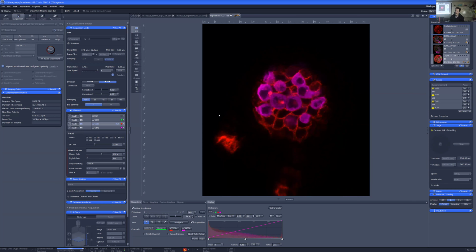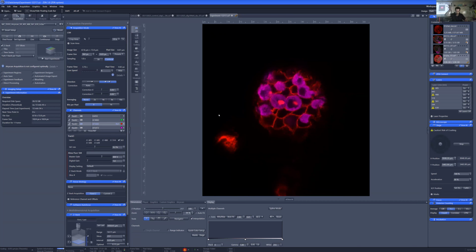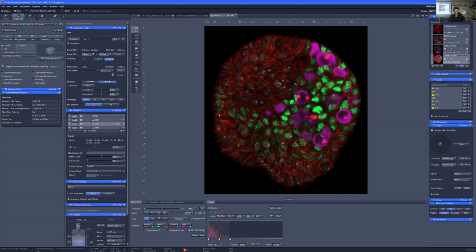I think I have a question. I'm just trying to phrase it in my head. Do you foresee AI helping you out with this process at all? Either with making corrections to have everything line up, or counting up the number of cells and pointing some things out with that? Yeah, it's a really, really good question.